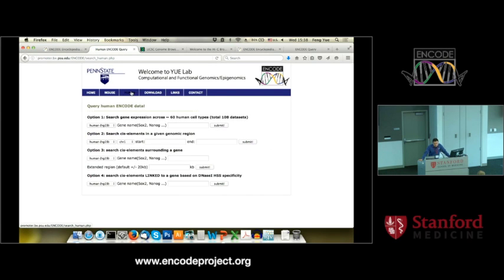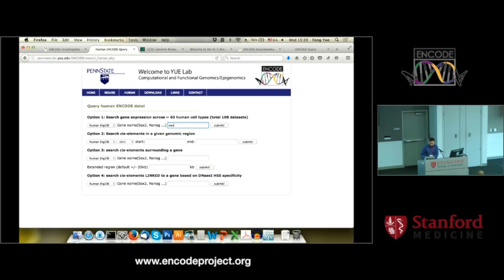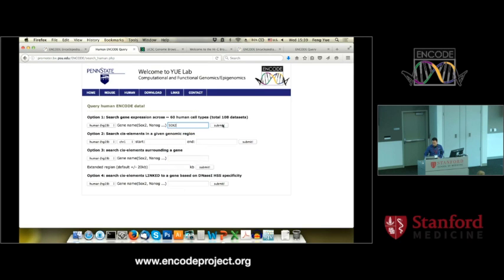There are four very simple options. You can search gene expression, search all the predicted TF binding sites, open chromatin for a given region or around a gene. And option four, you can search a cis-element linked to a gene based on DNase-I hypersensitive sites. In this text box, you can type any gene you like. My favorite gene is Sox2, so I type in Sox2. It also has an auto-complete function. Click Sox2, then click Submit.